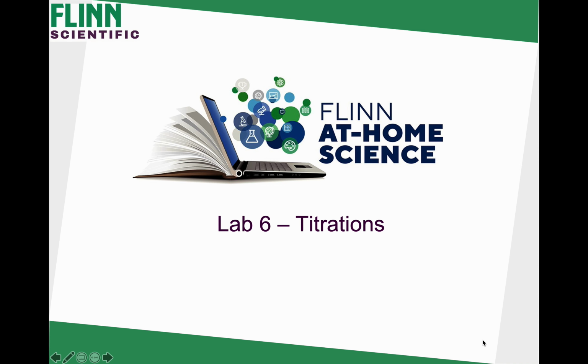You also have a data sheet, all of which can be found in OneNote and on Moodle. So you need to go ahead and watch the videos that are embedded in this PowerPoint. On Moodle and in OneNote, not only will you have a link to this screencast, but you will also find this PowerPoint with the videos in it, in which some different instructors or scientists have actually done an acid-base titration.